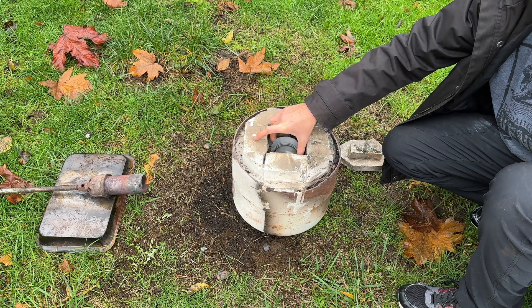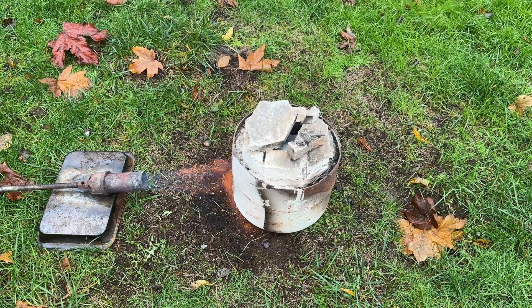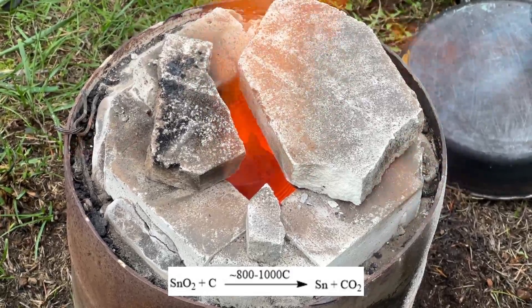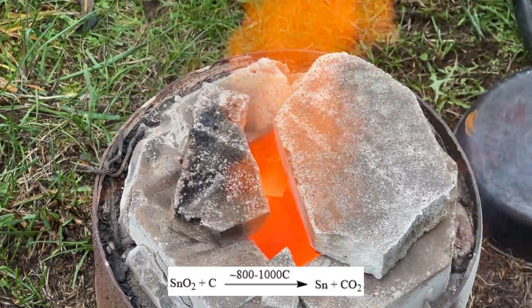The tin can was then placed in a furnace, and a large propane torch was used to heat the reaction mixture until it was glowing yellowish-orange. It was held at this temperature for 10-15 minutes to ensure a complete reaction and help the tin coalesce.